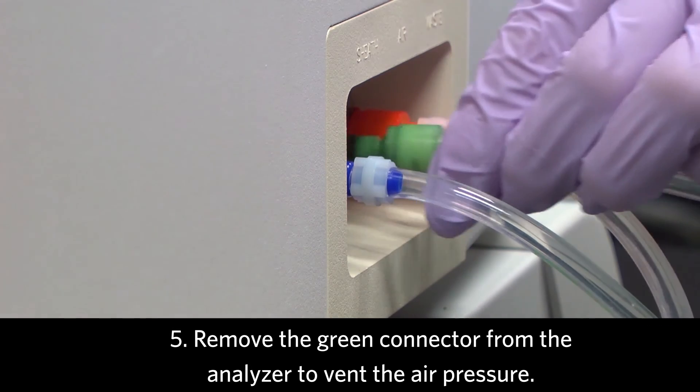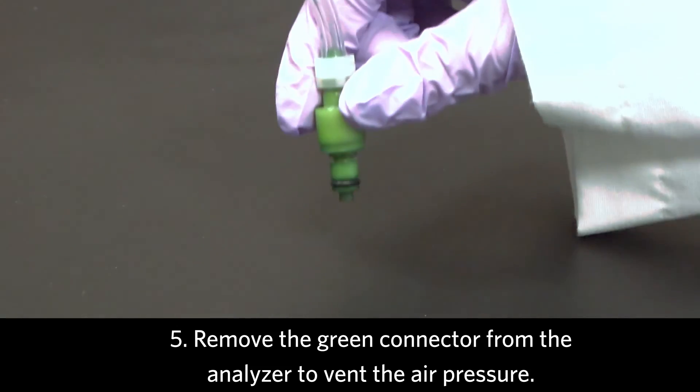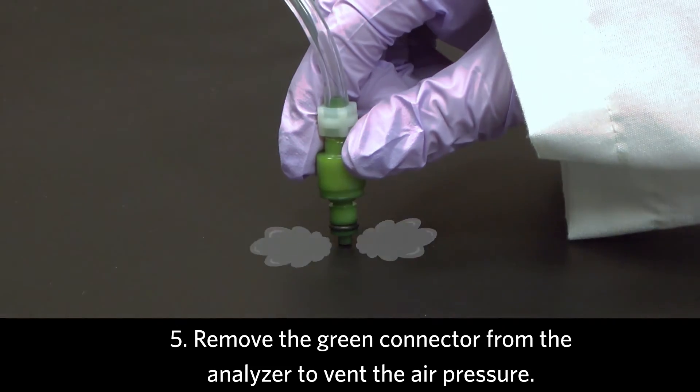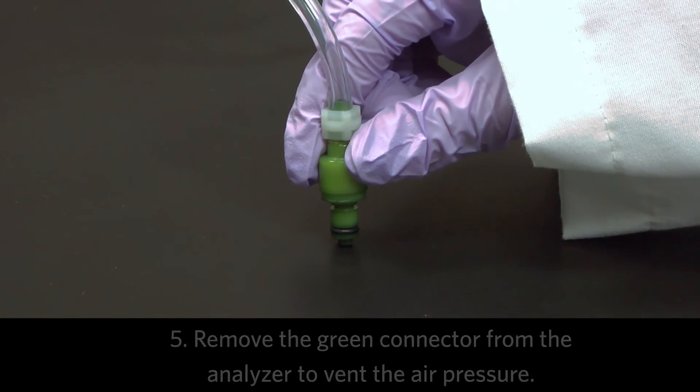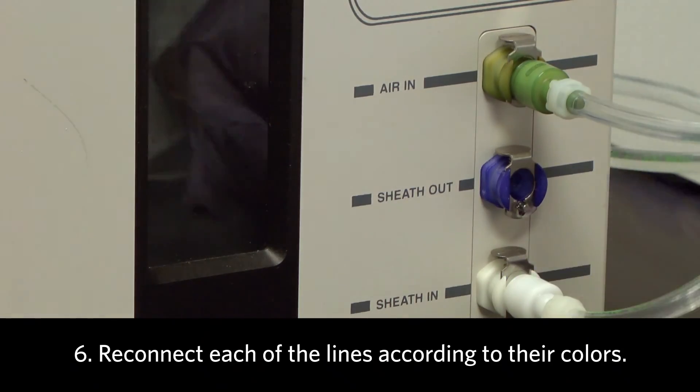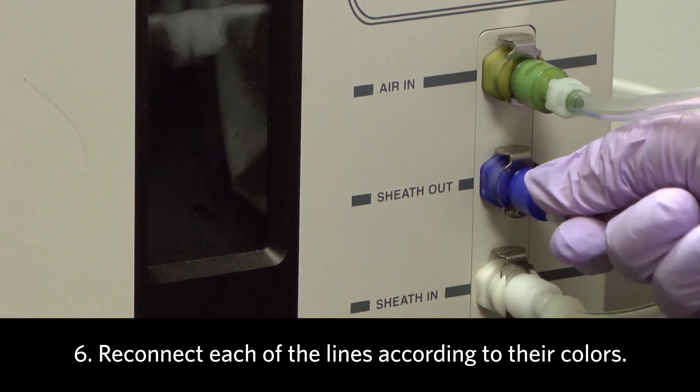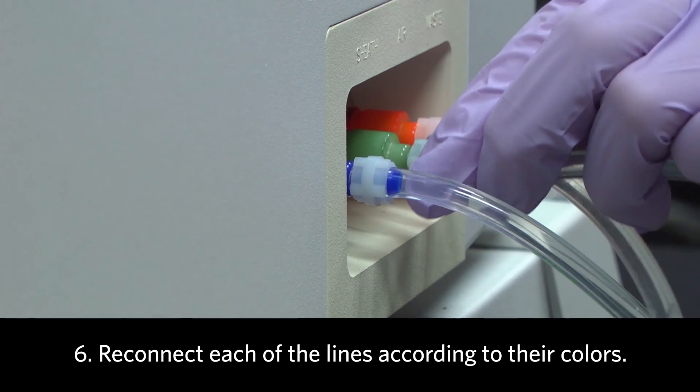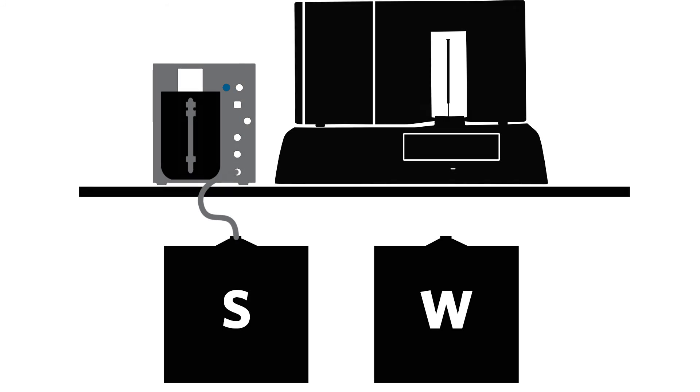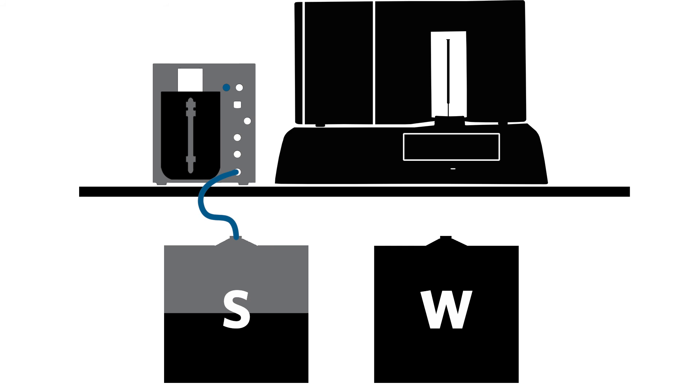Remove the green connector from the analyzer to vent the air pressure. Reconnect each of the lines according to their color. The SDS will begin to refill automatically.